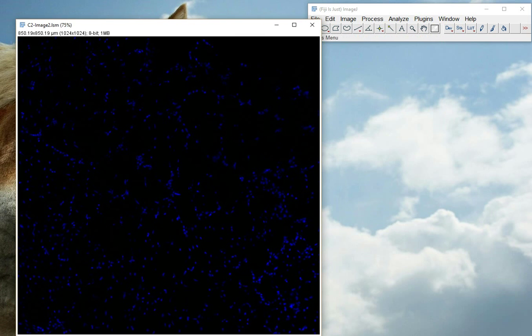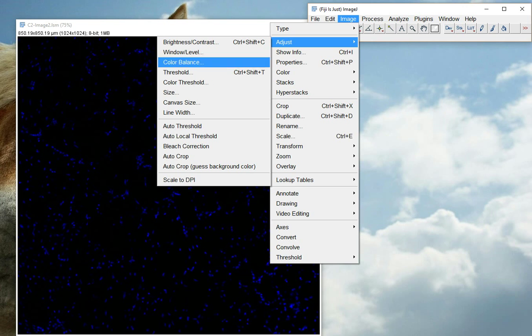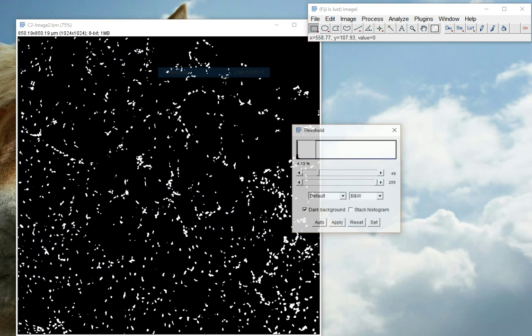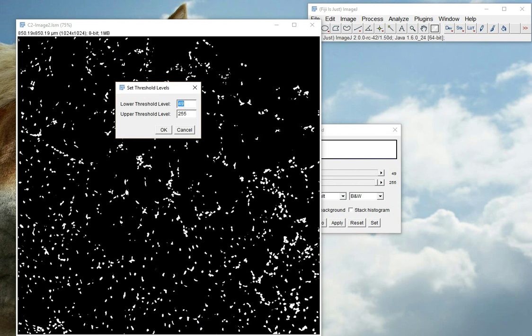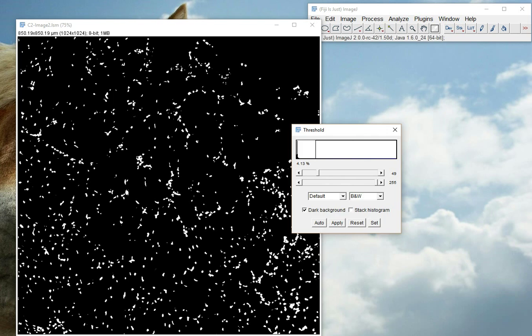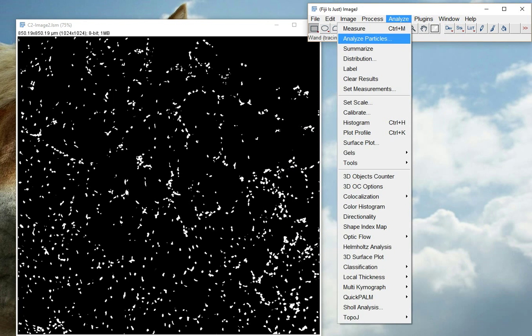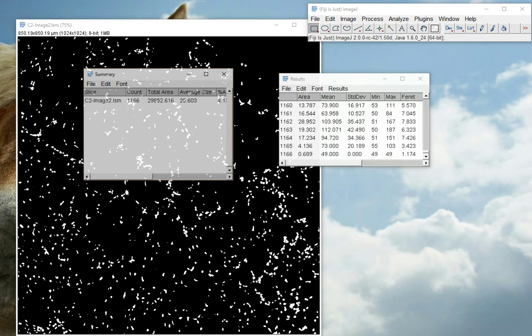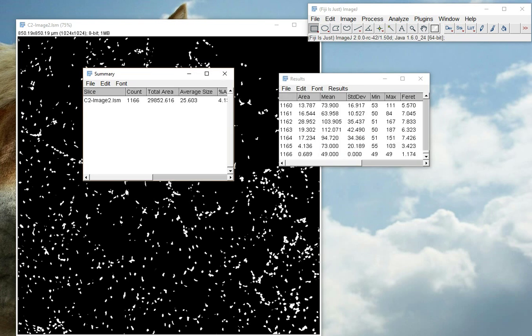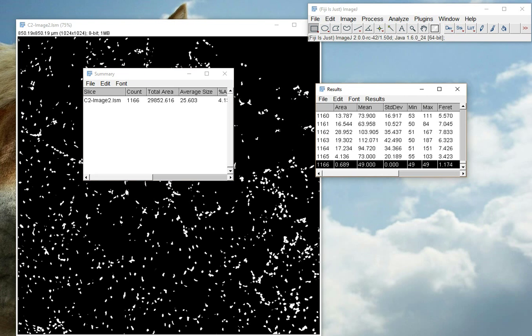And now do a crude threshold-analyzed particles analysis. Here we go. So we've got our counts all the way up to 1166.